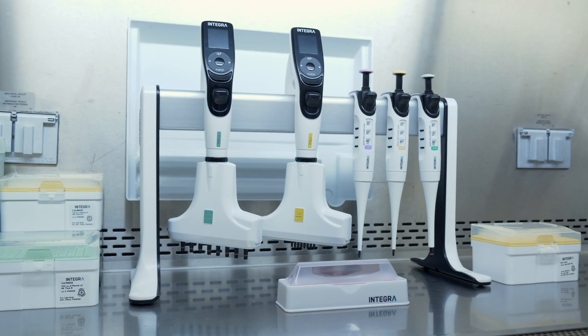Occasionally we use the Voyager for multiple dispensing, but really what we find it most helpful for is transitioning between plate formats.